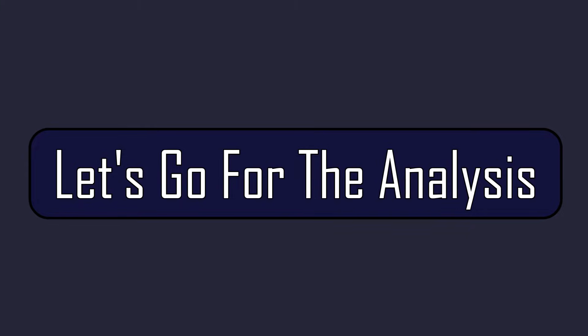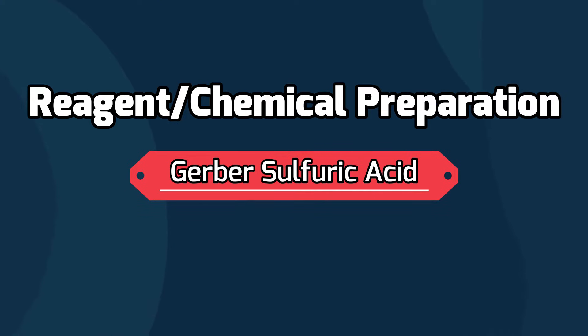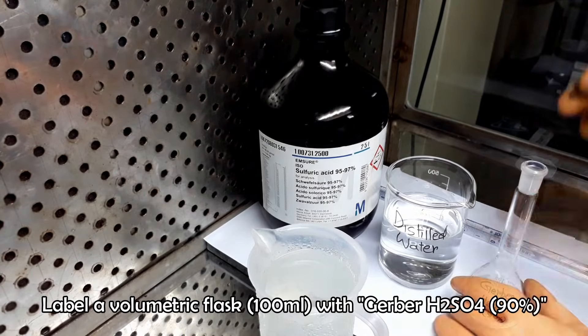Let's start from the chemical preparation. We need to prepare Gerber sulfuric acid only. Take a pre-leveled volumetric flask of 100 ml. Prepare an ice bath before starting the chemical preparation.